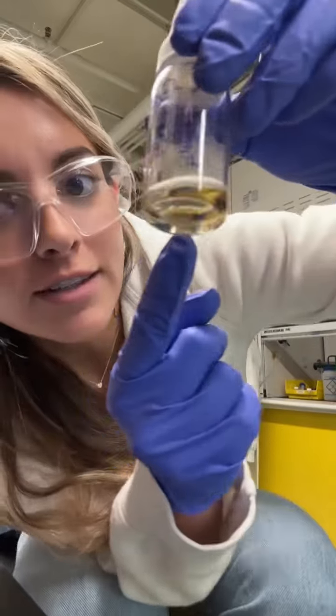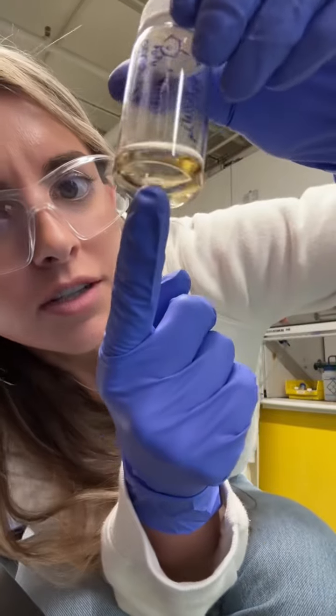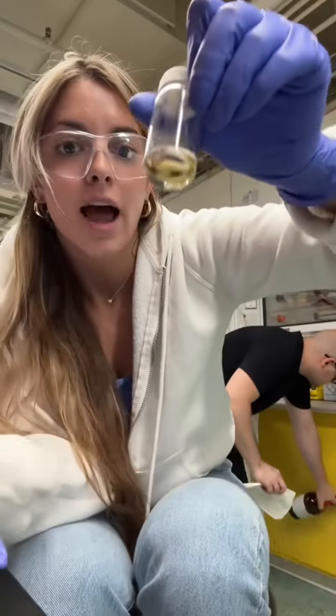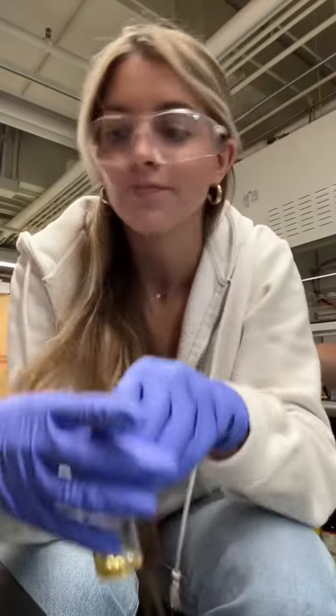So if you look at these, they kind of look like little prisms. And that all has to do with the way they initially packed, so the way their atoms were arranged. Pretty cool.